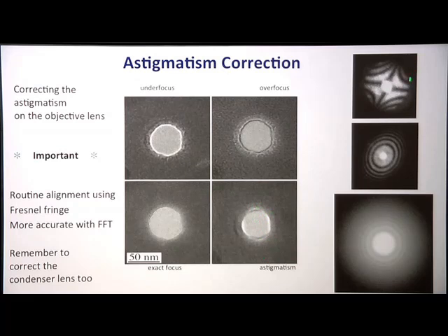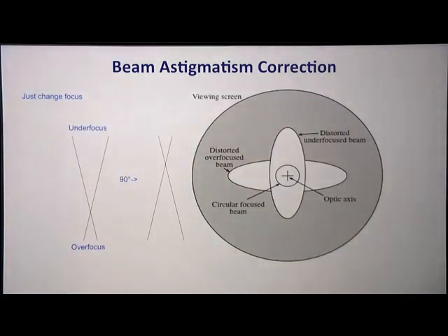So this is a very astigmatic Fourier transform of a carbon film like this. As you get it closer to stigmation, this thing gets rounder and rounder, and when it's in perfect stigmation, it should be perfectly round in the Fourier transform. Right? And that goes back to the way those phases are shifted with respect to the axis.